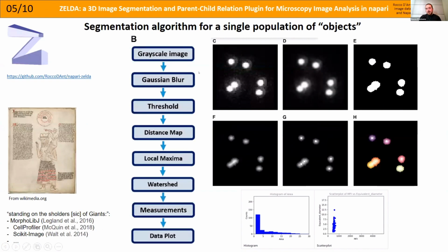Now, the algorithm that I use for the segmentation is not my creation. I'm just capitalizing on the, let's say, the work of giants in the field of bioimage analysis. And so what I'm doing is using some algorithms and libraries that have been written by somebody else, but I've tried to integrate them in a graphical user interface of Napari.